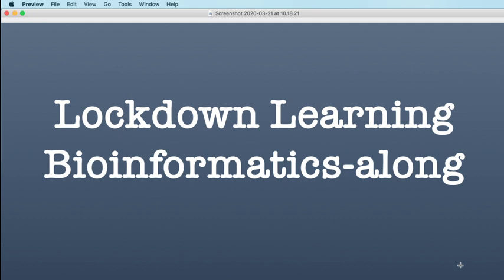So we had to do one which just pulled out the PubMed ID with a little bit of the text in front of it, to make sure that we were getting the right numbers essentially out of the file. And then we piped that into a second grep, which just retrieved the numbers from those little bits. So that just got us back the numbers that we were interested in.